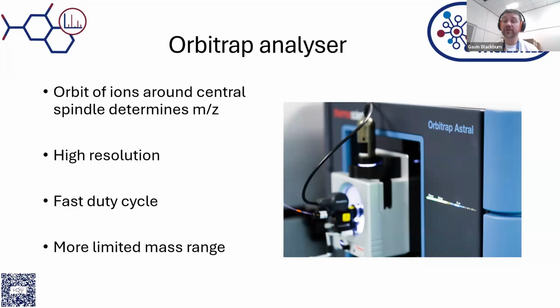Running a similar method on the Orbitrap Astral, which is not yet fully developed, but we are very, very close to doing that, we're just QCing some final samples, we are looking at between 5 and 7,000 proteins. So we're getting close to an order of magnitude difference in data just by being able to use this world-leading instrument that we now have access to.